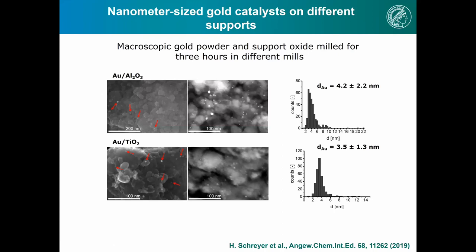It's really difficult to make these materials, but getting these types of particle sizes by grinding is actually quite surprising. Normally, grinding gives you particle sizes in the order of 500 nanometers, and then you have an agglomeration and diminution equilibrium, or steady state. Here, this is the final state. You can mill for hours, it stays like this.